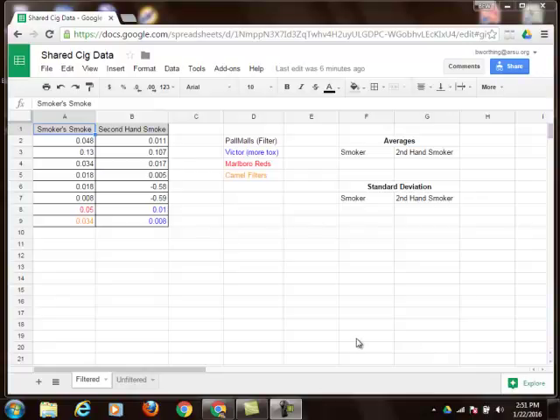Hi everyone, this is just a quick run through of how to play around with the cigarette lab data.